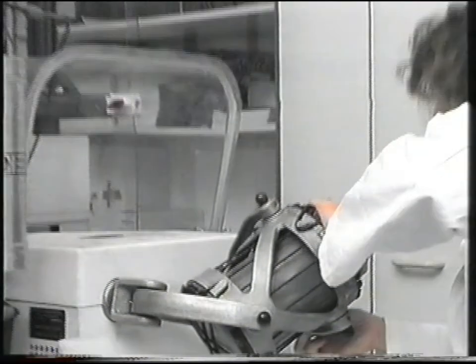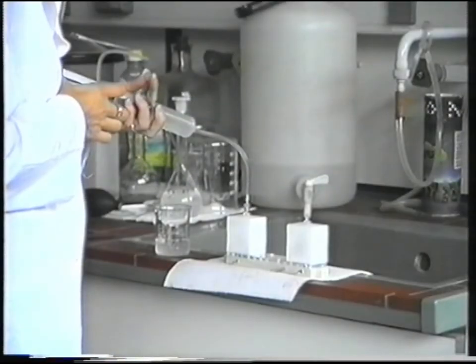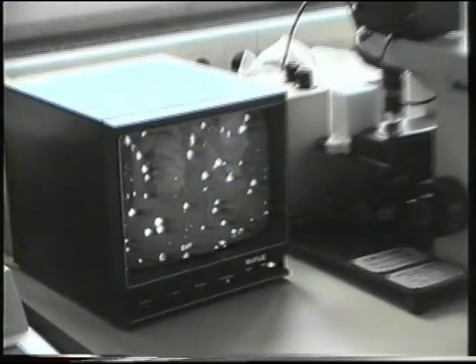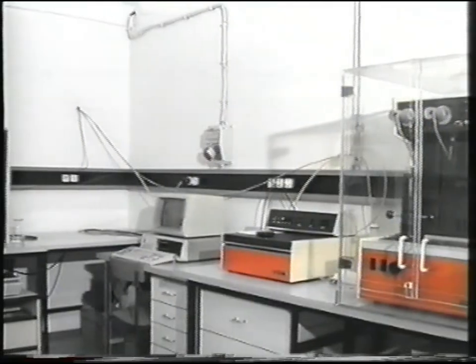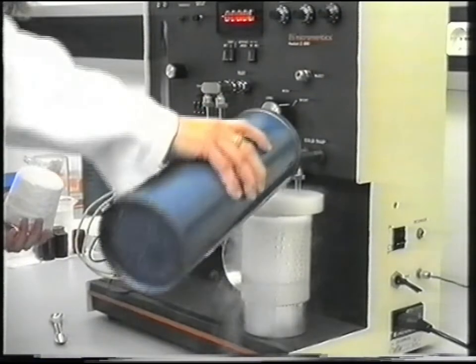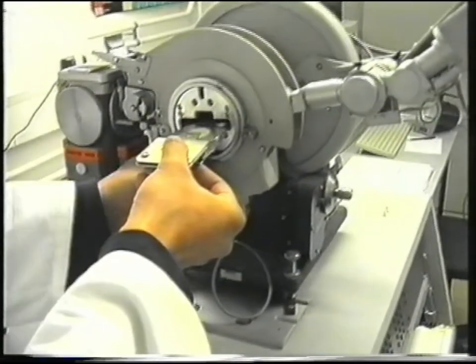The main area of research comprises the synthesis and characterisation of new microporous crystalline zeolites and zeolite-like materials. Research is focused on detailed studies of alumina phosphates, since they represent a class of potentially widely useful substances if one considers their diverse physicochemical properties. Aluminal phosphates with specifically targeted properties can be synthesised by means of the combination of specific starting materials and template-directed conditions of synthesis.